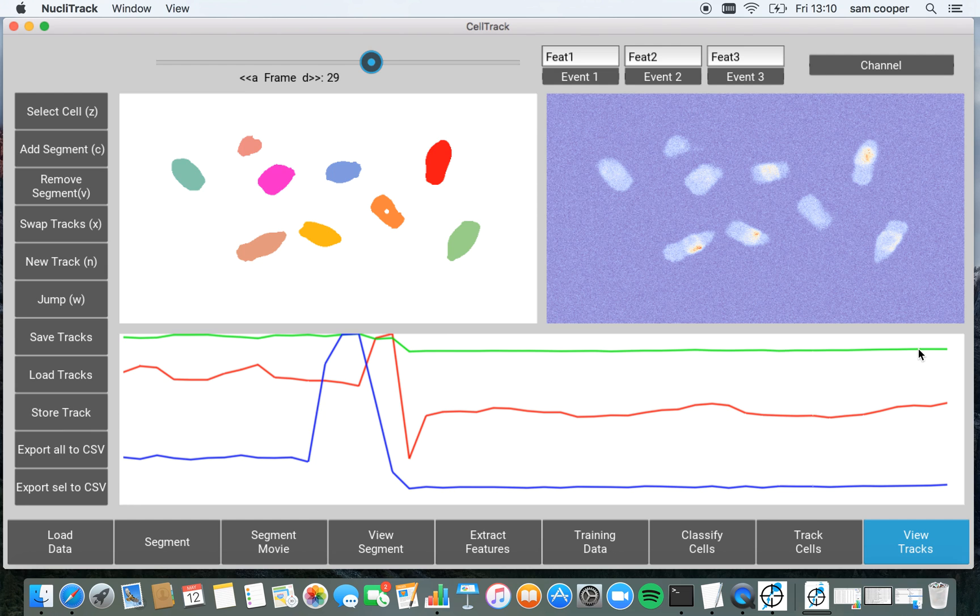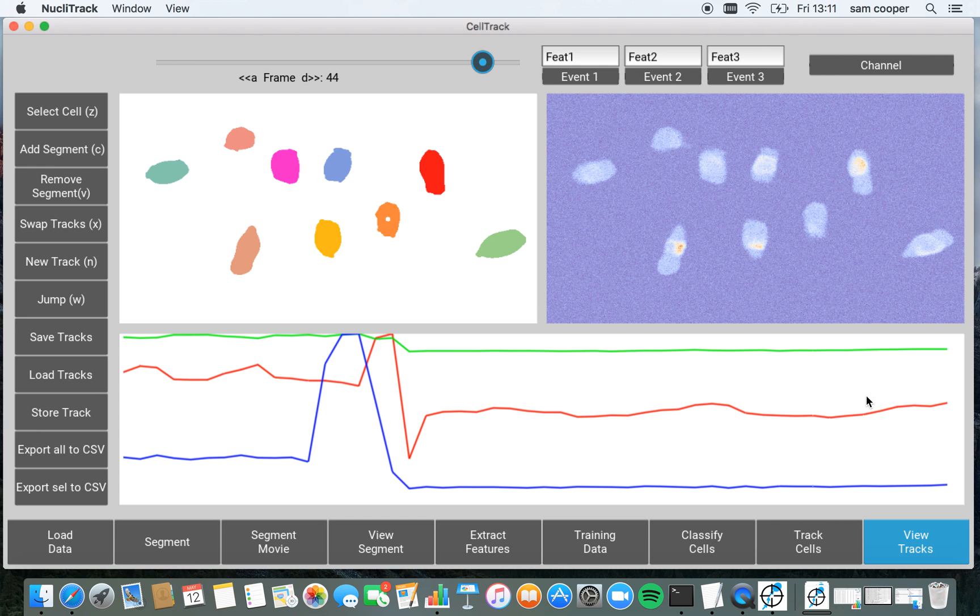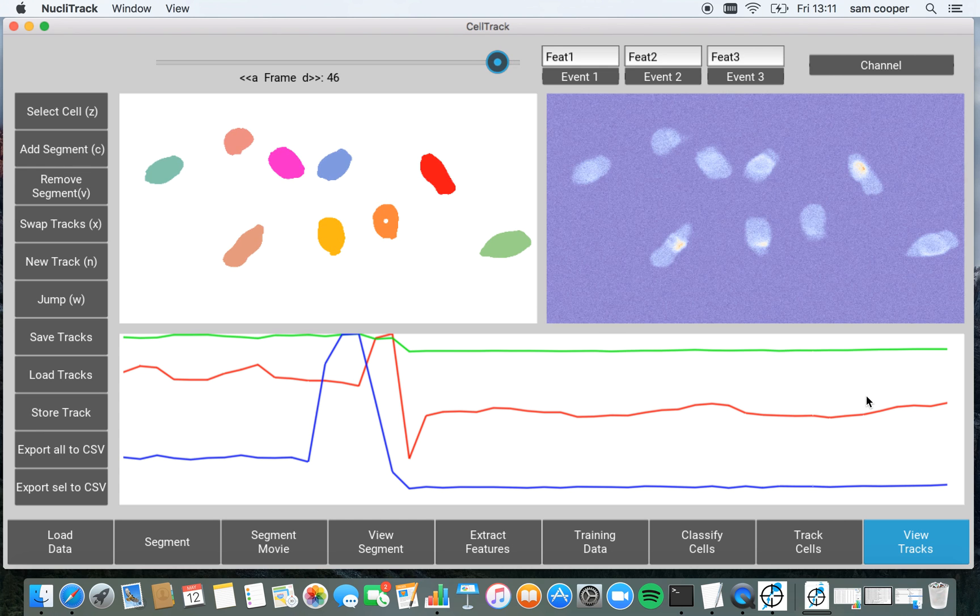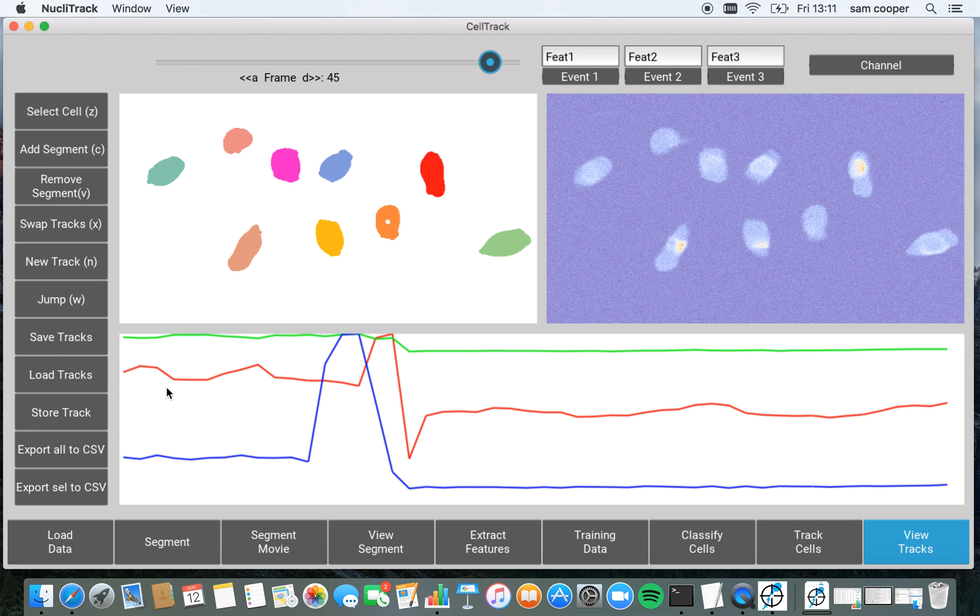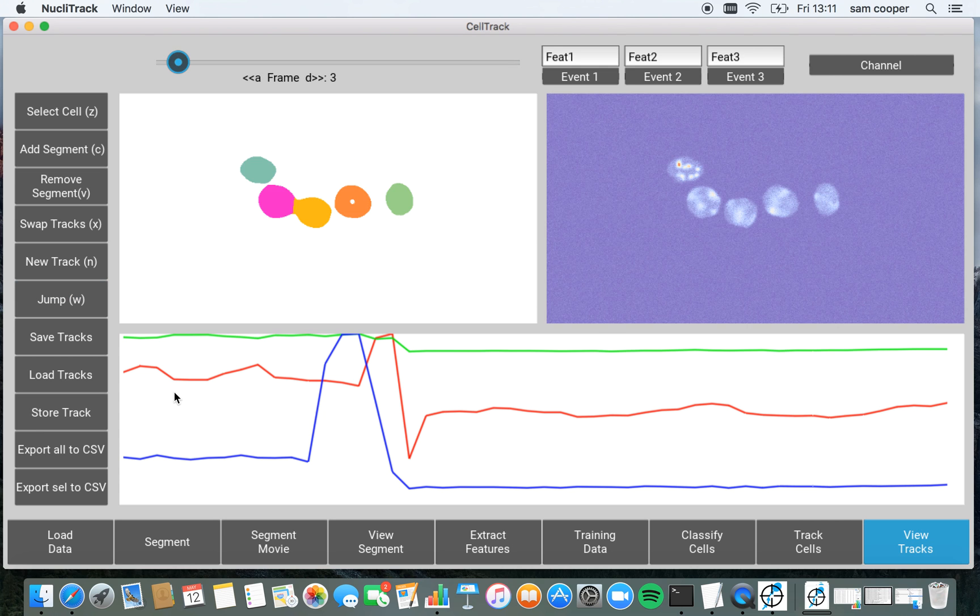And we can also jump about the video by pressing W and then clicking on the graph. So if you want to go to the very end, I can press W, skip to this end here, or press W and skip to this end here.